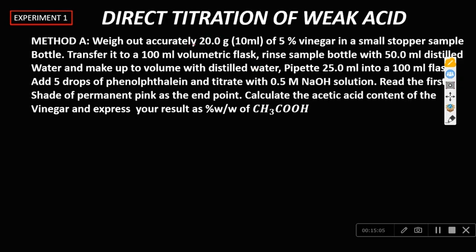You measured how many gram? 20 gram. You transferred it into what? 100 ml. Out of this, you prepared 25 ml. Are you getting it? Into what? 100 ml flask, and add 5 drops of phenolphthalein and titrate with 0.5 molar sodium hydroxide.